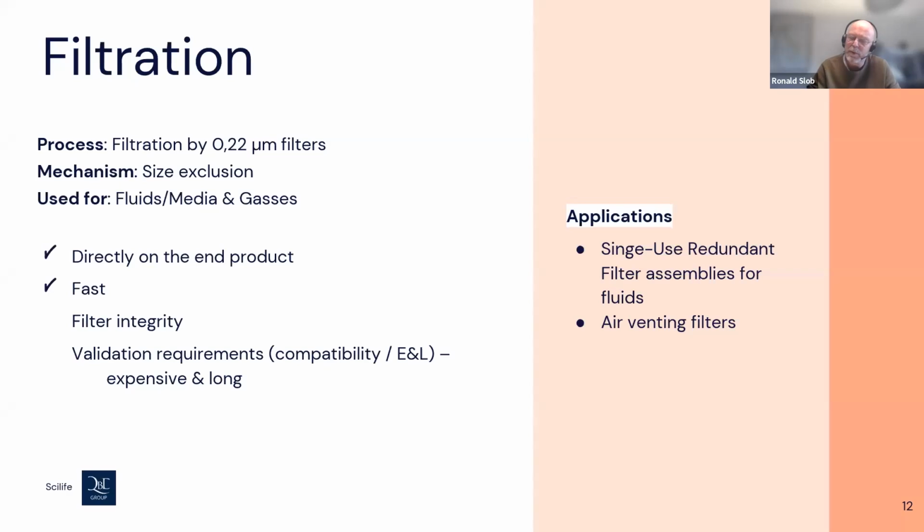The one thing is that because the product is going over the filter, it can have negative effects on your product itself. So there are a lot of requirements to look at: compatibility, extractables, leachables, so that you don't put anything additional into your product because it went over the filter, a sort of extraction.